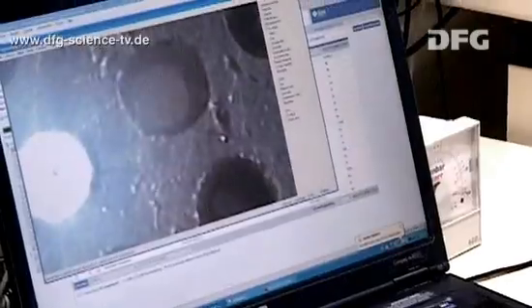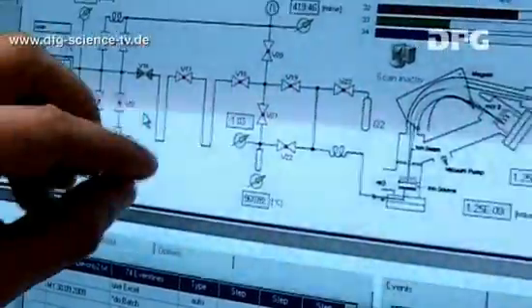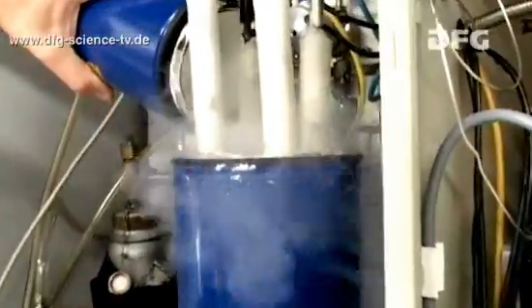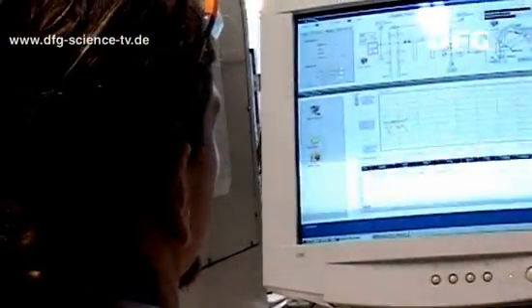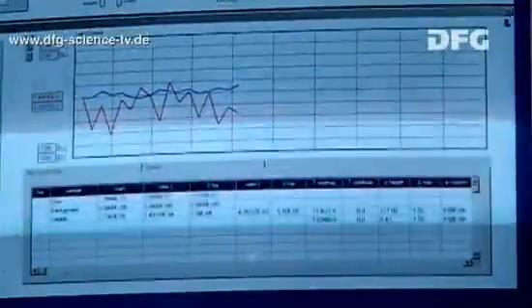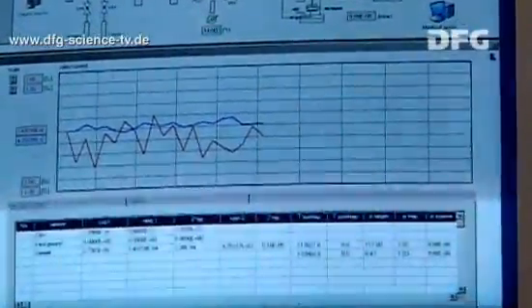The released oxygen is transferred along an approximately 3-meter path to the mass spectrometer. So-called cold traps at -196 degrees Celsius keep undesirable gases out of the instrument. The ratio of heavy to light oxygen can then be measured. Based on the acquired data, the scientists hope to draw conclusions on how warm or cold it was during the respective period and what the prevalent wind systems were.